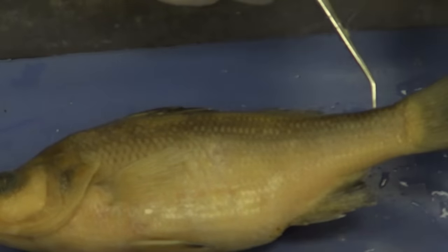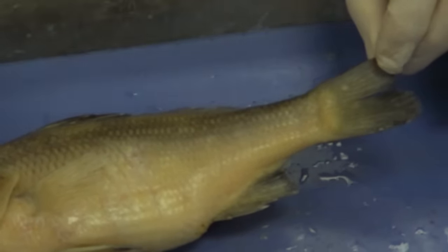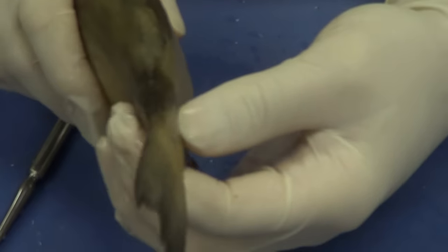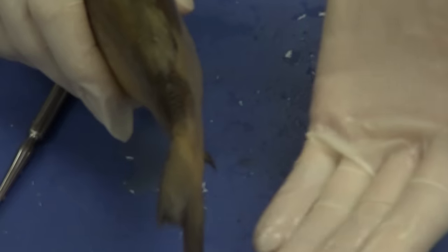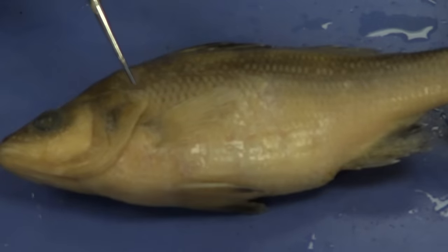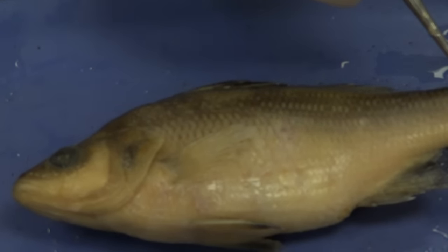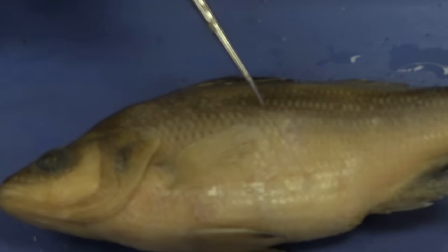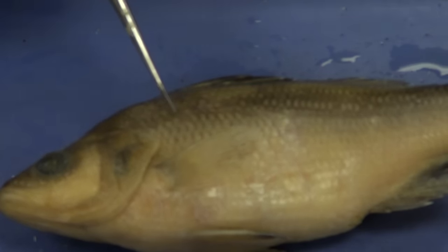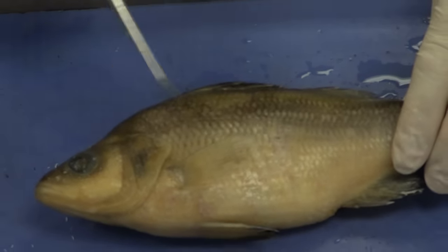If we go more posterior, we see the caudal fin, which is used for propulsion. Fish move their caudal fin from side to side, unlike a mammal which moves up and down. Now right here we see a very faint line going all the way across the side of the fish — this is the lateral line, used for vibration detection. We saw something similar in the lamprey. The lateral line is on both sides — make sure to identify both sides.